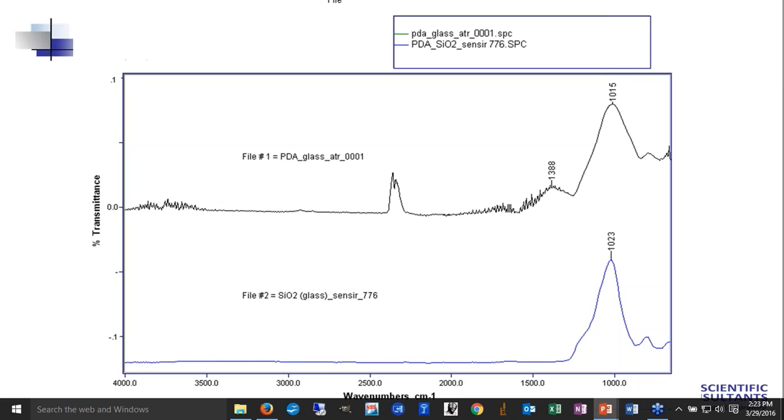And then by IR, just to complete the cycle, we see that we have a silicon oxygen type of material. This is by attenuated total internal reflectance with an ATR objective on the IR microscope. So we still have comprehensive data. Not all of it's necessary to do, but for demonstration purposes, I think it's useful.